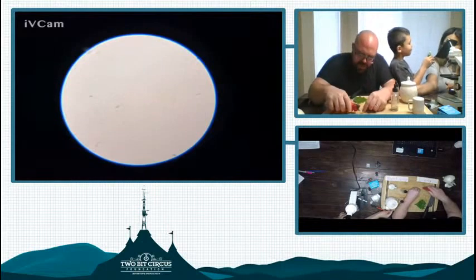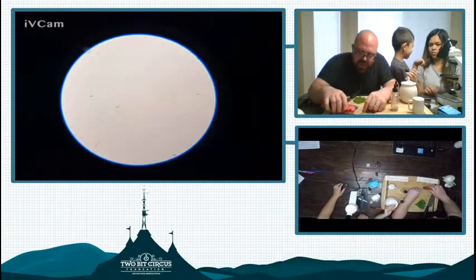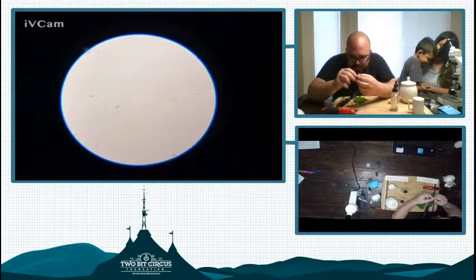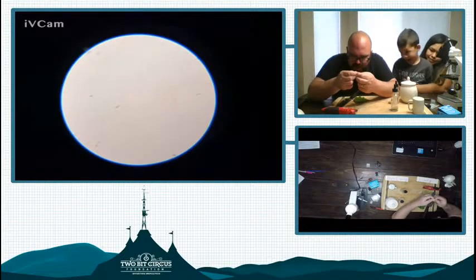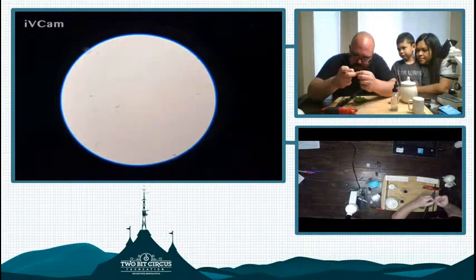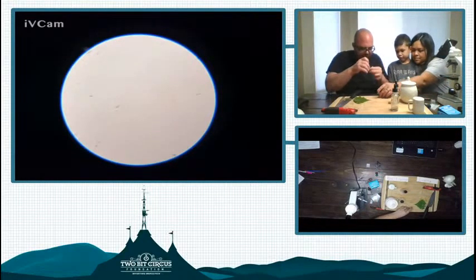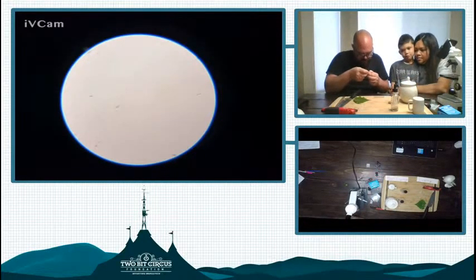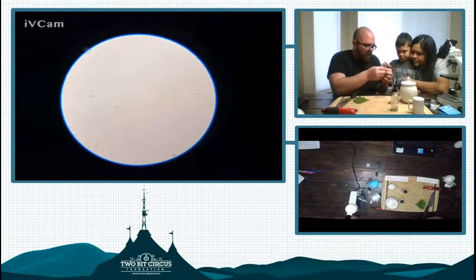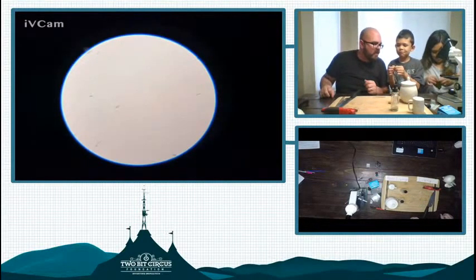You can just put the leaf under the microscope, but it's better if you get a little sample layer. Some leaves are thicker than others, which allows you to separate the layers. And if you have more precise fingers and smaller fingers than I do, you might have better luck. Robert, are you able to separate those layers of the leaf? Try. Can you try? You have really tiny fingers. You might be having better luck than I do.